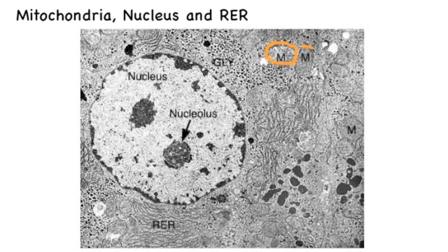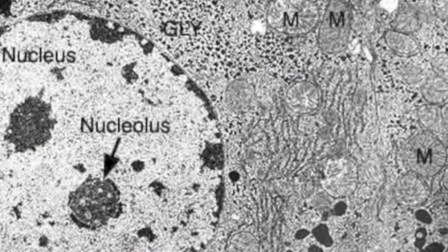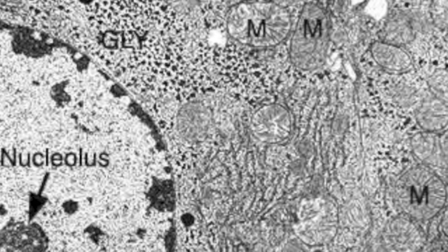Here I'm distinguishing between the mitochondria, which I'm circling in orange labelled with an M, the rough endoplasmic reticulum RER also in orange, and I'm circling the nucleus in red. Zooming in, it is once again possible to identify the mitochondria by the lines on the inside formed by the inner membrane.